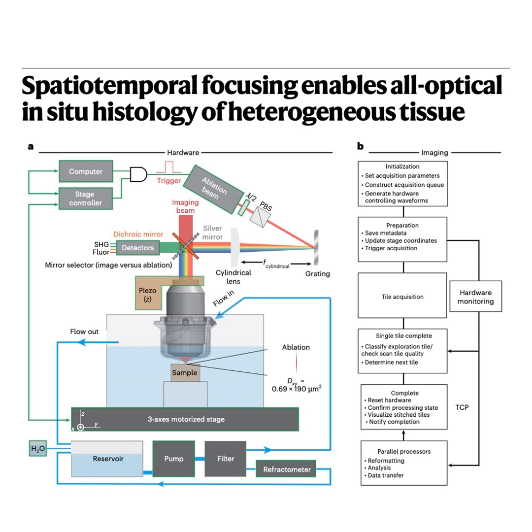So comparing this to other ways of getting 3D anatomical data, this all-optical serial two-photon microscopy, powered by STF and the smart robotic control, really stands out. It seems unique in its ability to achieve that submicrometer resolution in situ imaging across the intact craniocerebral system, handling both bone and brain. What are the core advantages then? Minimal sample preparation is a big one. No harsh clearing chemicals, no embedding in wax, minimal sample deformation because the ablation is non-contact, it's just light. And the crucial one, preservation of the anatomical integrity, especially at those tricky interfaces between different tissue types. That seems huge for understanding complex structures accurately.